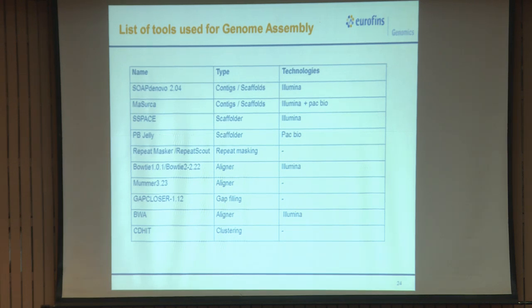For example, if I am only able to map 10% of the reads back and the rest of the reads are not mapping, that means the overlapping or whatever we have done is wrong. My genome is not getting mapped. The reads which we have generated should be at least 90 to 95% mapping back to the genome, right?